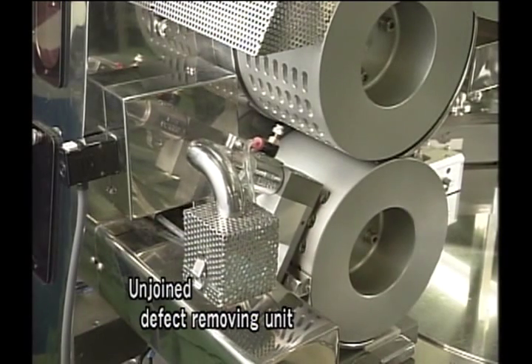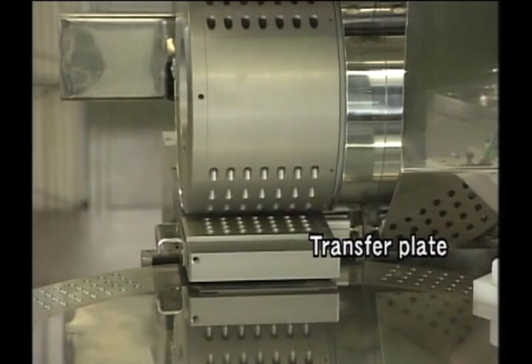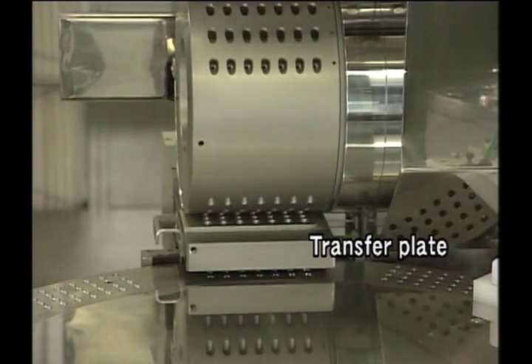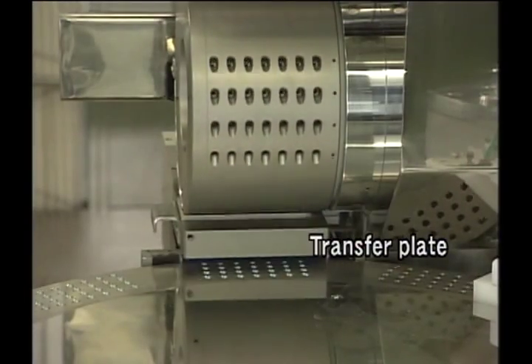In the case of an unjoined product being detected, the product will be automatically removed by the transporting roller and fed into the cap disc intermittently through the transfer plate. At the same time, the cap and body will be separated.